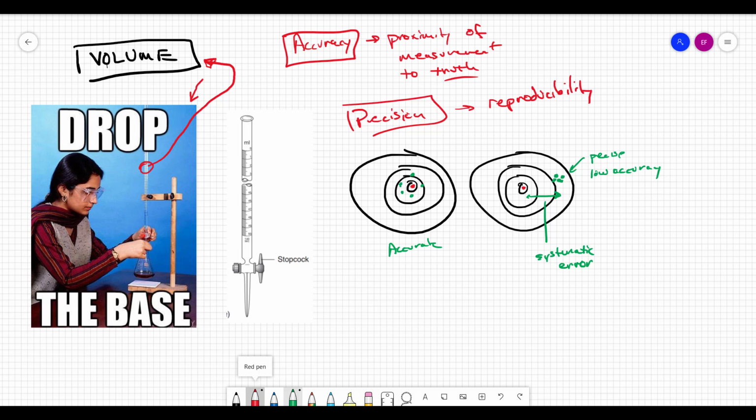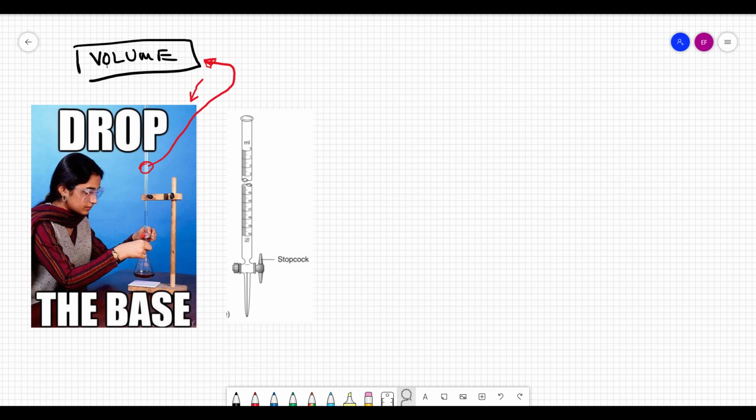We're going to talk quite a bit about error in the next few videos, but I just want to give you a quick heads up when I use the terms accuracy and precision when talking about volumetric glassware. This is what I mean by these two. They're not interchangeable. So when you did your first titration, you almost certainly used this thing here, which is called a Buret. And a Buret is this very accurate and precise volumetric piece of glassware, almost one of the most accurate and precise pieces of glassware, which allows us to read differences in volumes very accurately and precisely. And typically we can read volumes out to plus or minus 0.02 milliliters with a standard Buret.